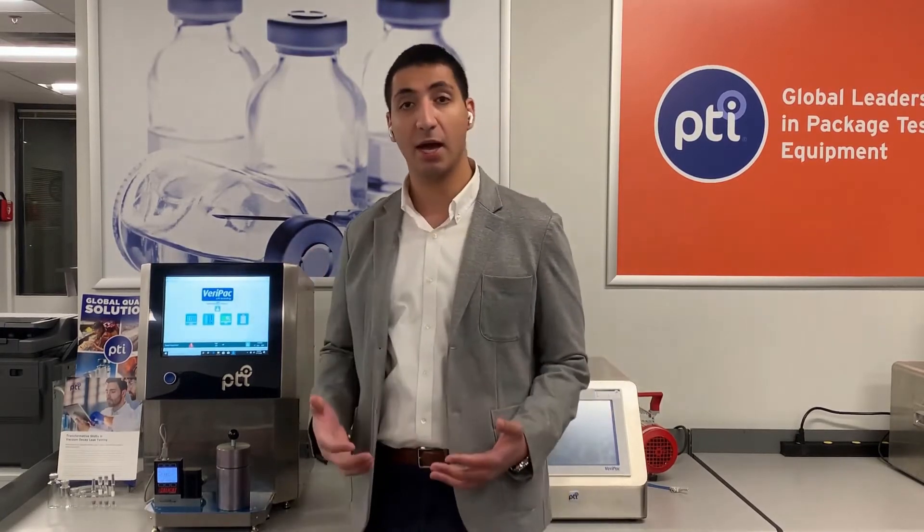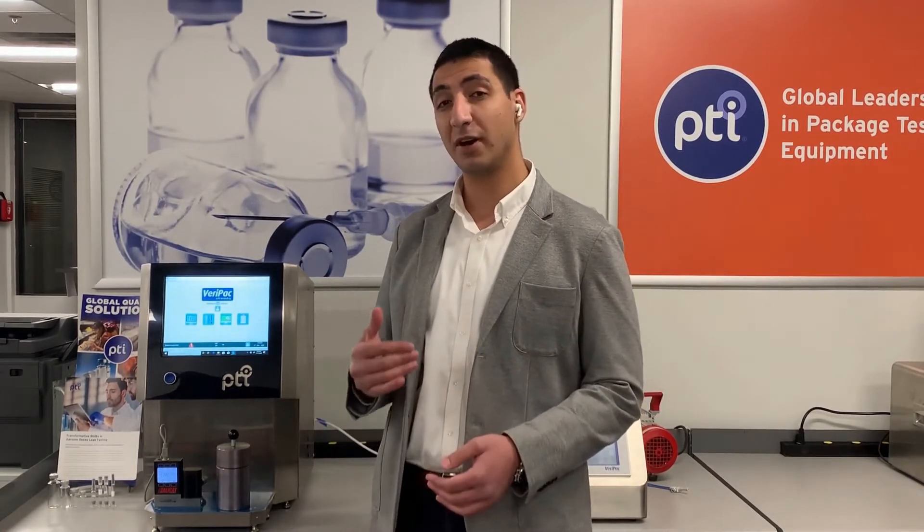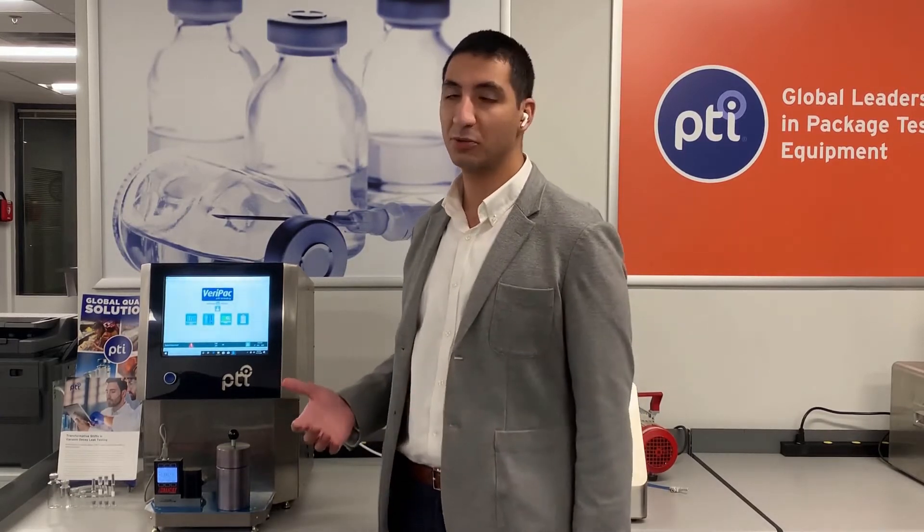Here at PTI, we pride ourselves in being the global leaders of package quality testing equipment. We bring to the table over 35 years of experience. With that, let's get started with the latest and greatest.